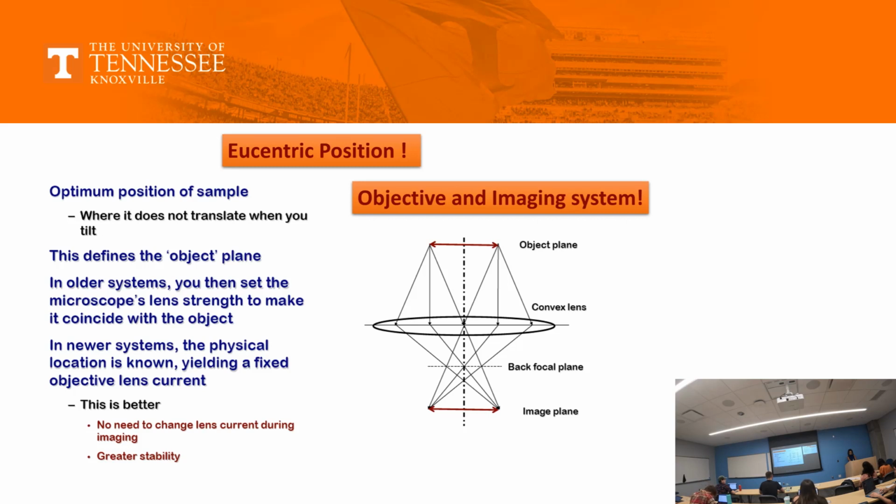So C1, the condenser lens, we are using it for brightness, spot size, or am I not saying it in the right order?